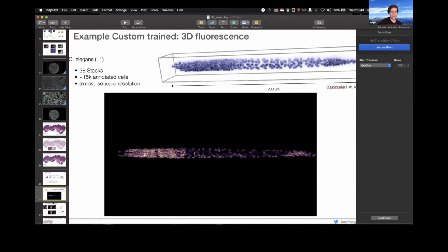Any other questions? To ask for the scaling of the 3D distance map: you do not scale the input image or your mask, but you scale, so to say, the vector. So XY is typically square-like and high resolution, and in Z you have... I don't understand what you mean by scaling the vectors. Yes, I understand what you mean by scaling.